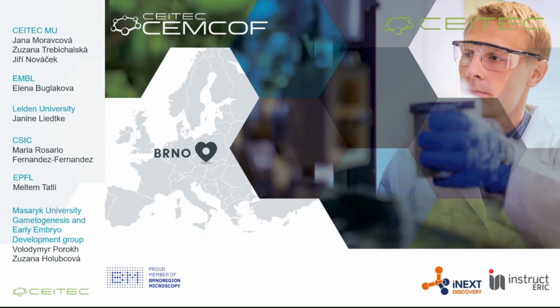One super quick question. For the high pressure freezing, do you have any form of quality control, so that if you put your sample in the SEM, you can see before you start milling whether this is okay or just utter crap? You don't see light devitrification. You can see if it is totally not frozen, without any structure preserved.